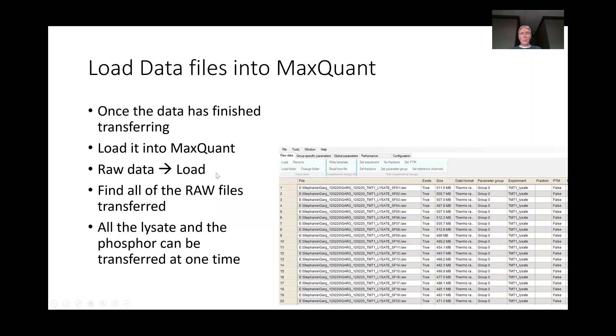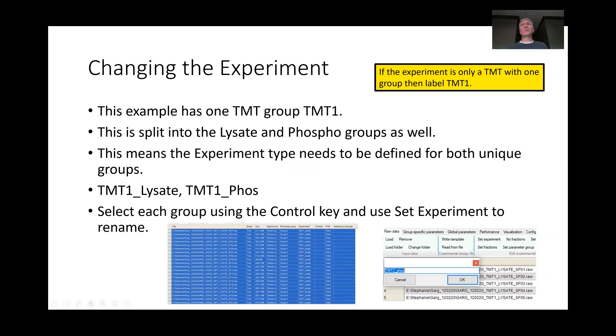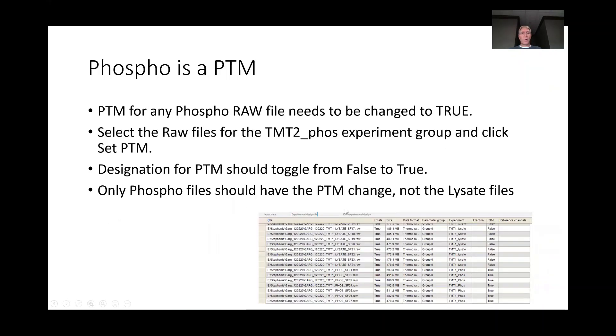We also want to load the data files into MaxQuant. I'm assuming you can do that. We might want to change the experiments, and I will do that. A lot of times people that do TMT also want to check for phosphorylation. They do a phospho enrichment, so I can show you how we're going to set that up as well.